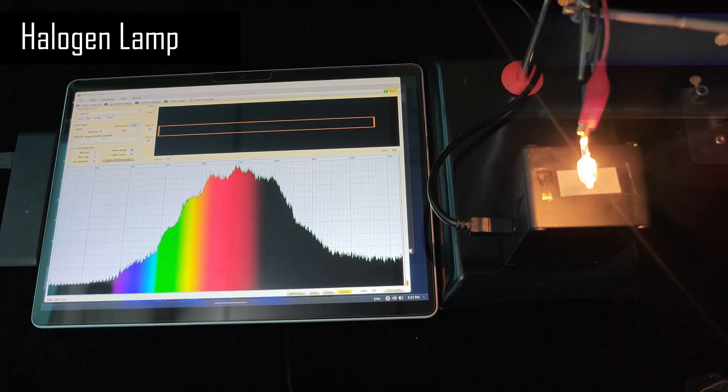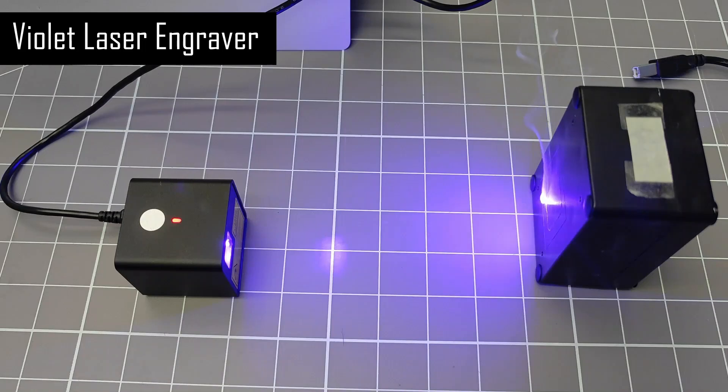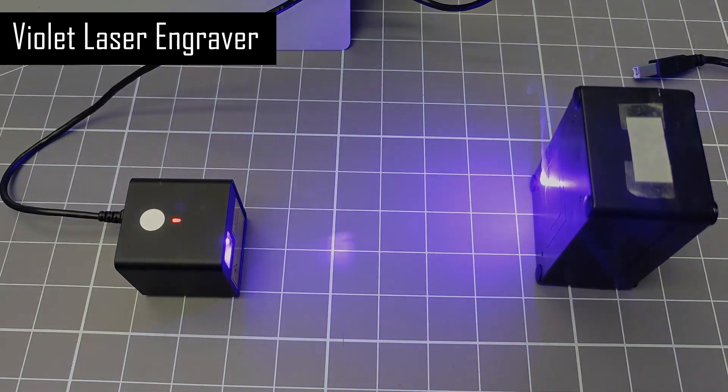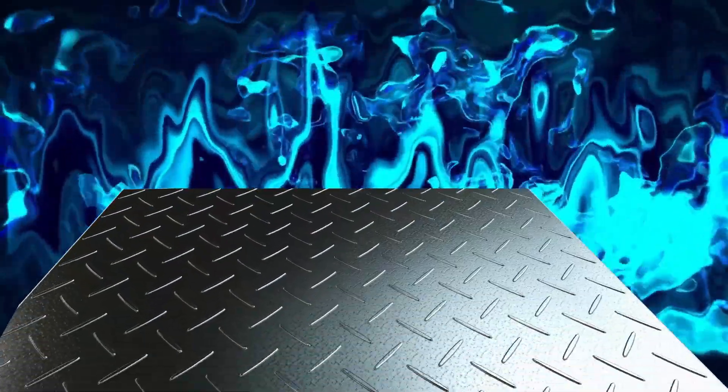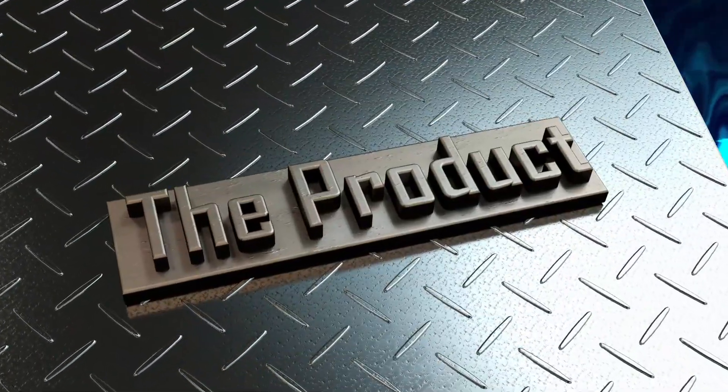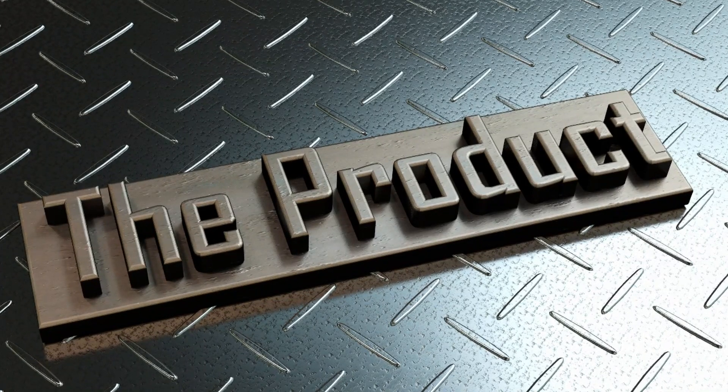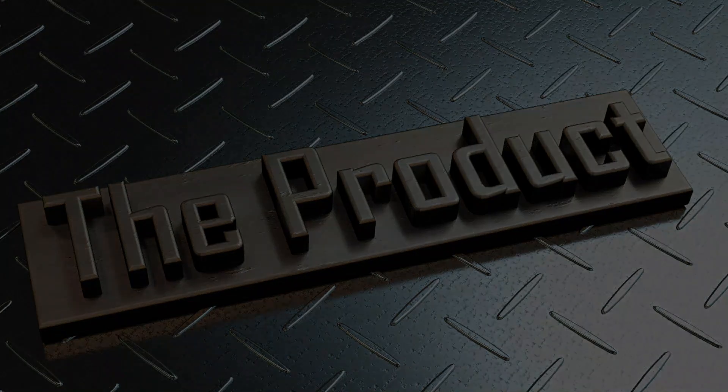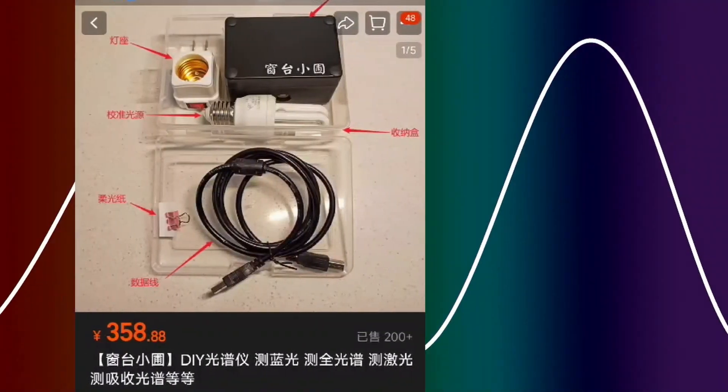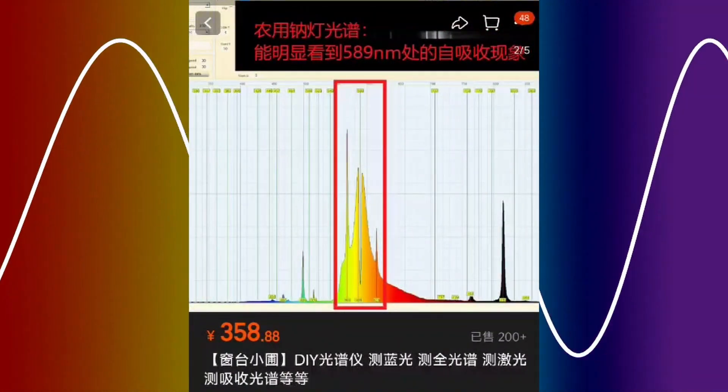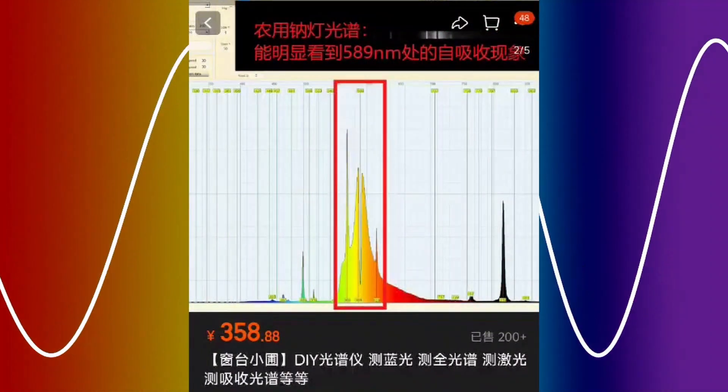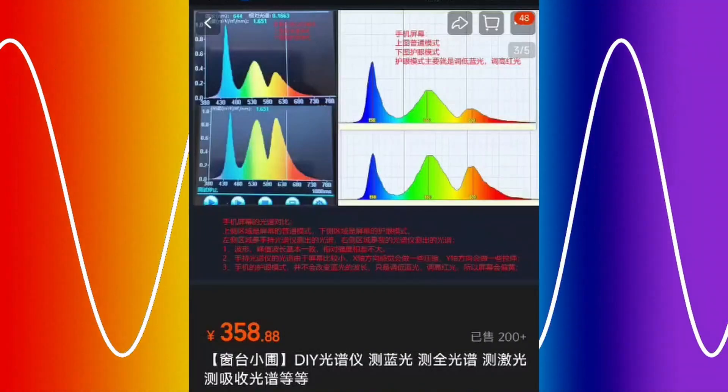So let's just recap a few of the key details about this small, cheap spectrometer. Firstly, this device is not a product, but a project, a DIY project to be more accurate. Every single one is hand built by this guy. Say hello to Mr. Kang and his DIY spectrometer.